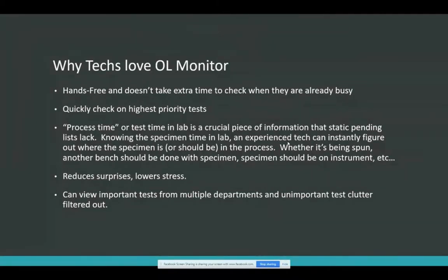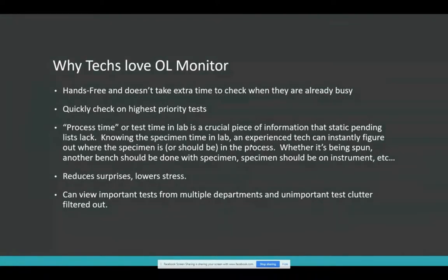You can do important tasks for multiple departments and filter out a bunch of stuff. A lot of labs throw everything on their overdue log and use the advanced filtering to filter out everything they're not concerned with. They're able to fine tune exactly what shows up on the display — not just limited to a department. You can pull them all together and have them nicely sorted.